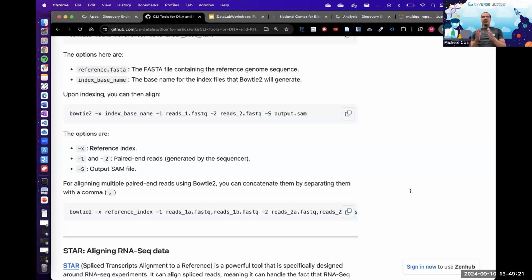Yes, so anything between 300 and 1,000, usually what we will do is sit down and say, okay, what is the best aligner for all of these reads that are neither short nor long? The quick answer is using more aligners, because you have a reference genome, and then you do alignments of the long reads, and then you do alignments of the short reads. Ideally, that improves the accuracy and the quality of your overall genome assembly, depending on your sequencing.